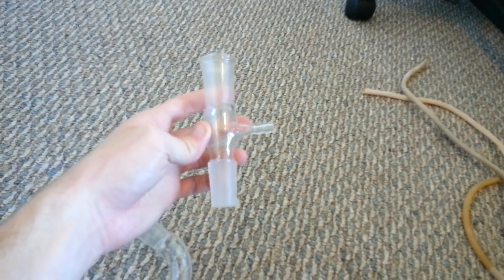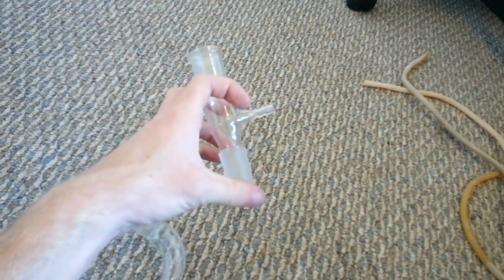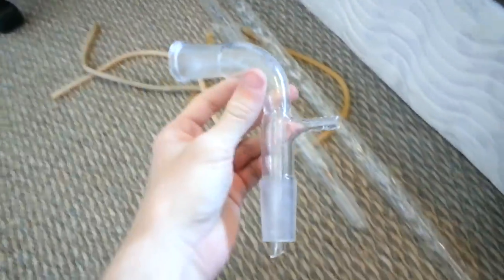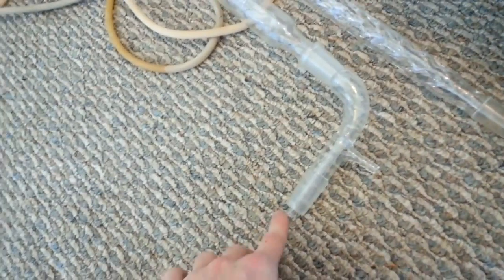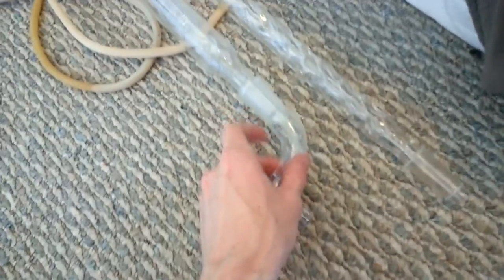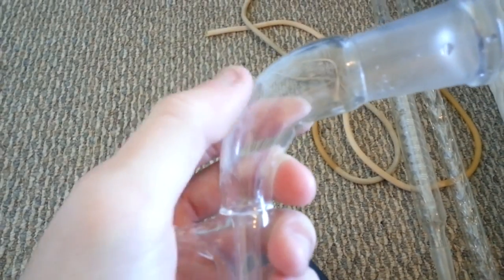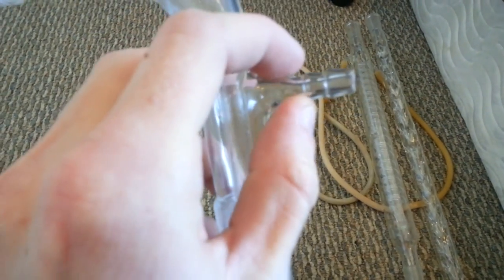This is good if you just want to get gas in or out. What I use this for primarily is put a thermometer adapter on the top, put a wire down into the flask when I'm doing electrolysis, and then the gas can come back up and out. This piece hooks onto the end of the condensing column — once stuff is condensed, it goes into this thing down and out of this tube. It's also got a vent so the liquid comes out of the tube, but any gases that are created can come back along the sides of the tube and back up and out. It's kind of nice if your experiment is making any kind of gases or nastiness like that.